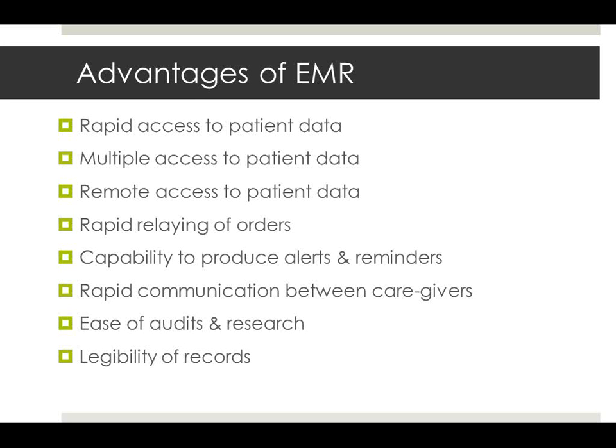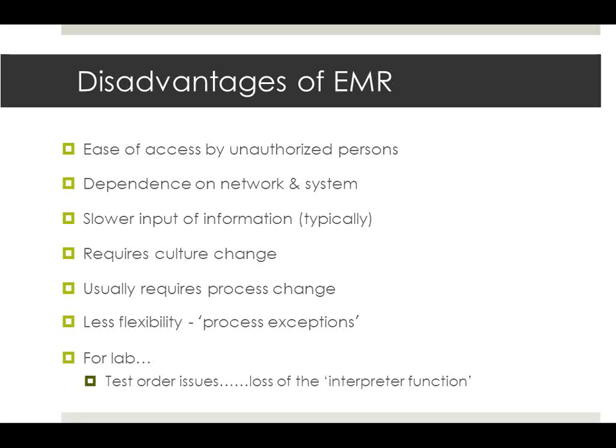The capability to produce the alerts and reminders, rapid communication between caregivers, ease of audits and research, and then improved legibility of records. So you can actually read those progress notes that someone wrote at 2 o'clock in the morning.